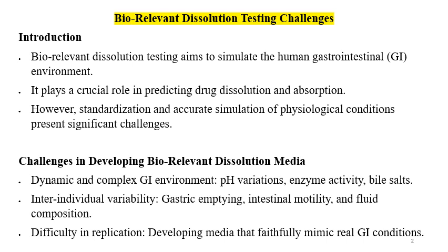The objective or aim of biorelevant dissolution testing is to simulate the GI tract environment, and this testing plays a critical role in predicting drug dissolution and absorption.